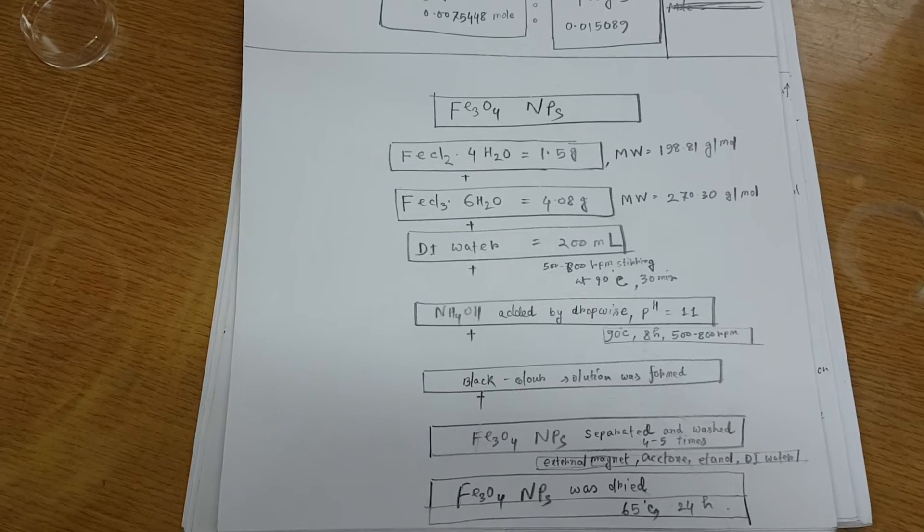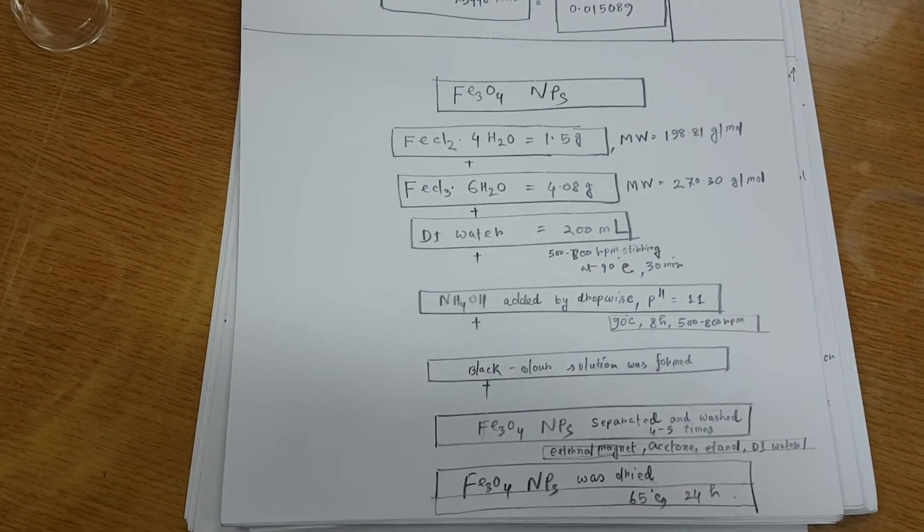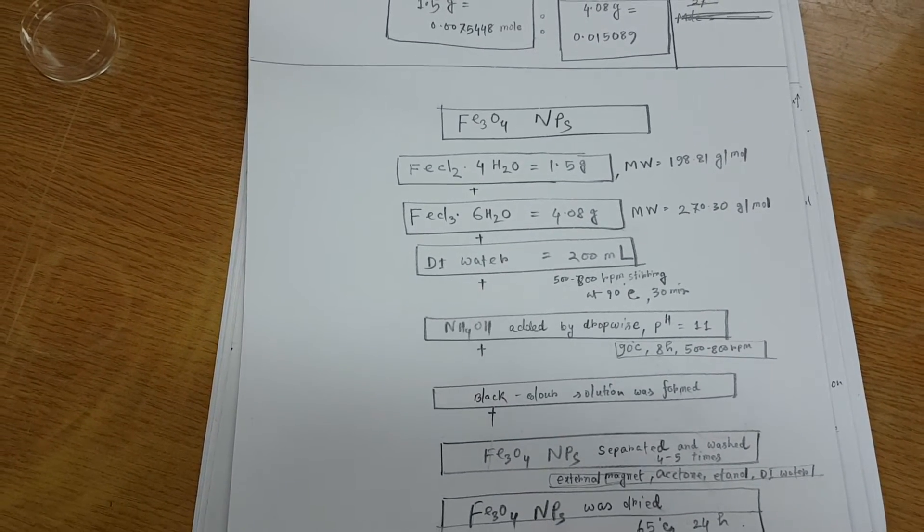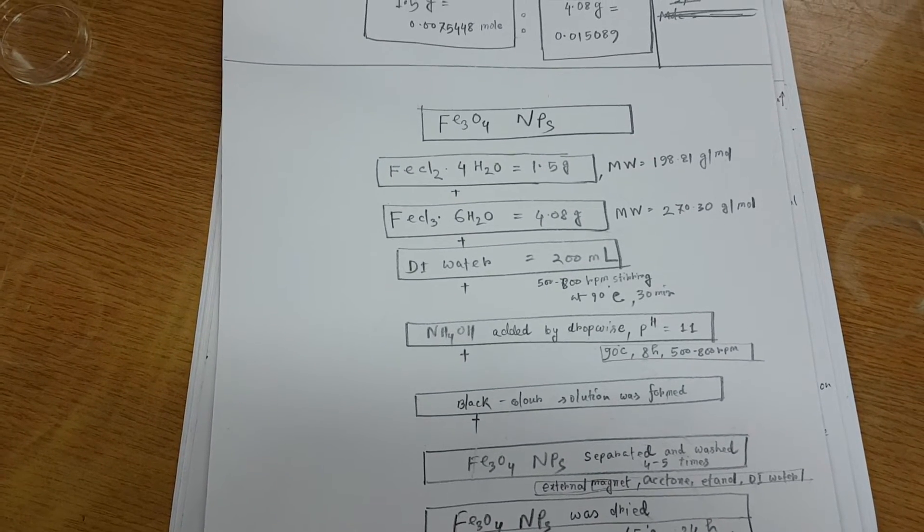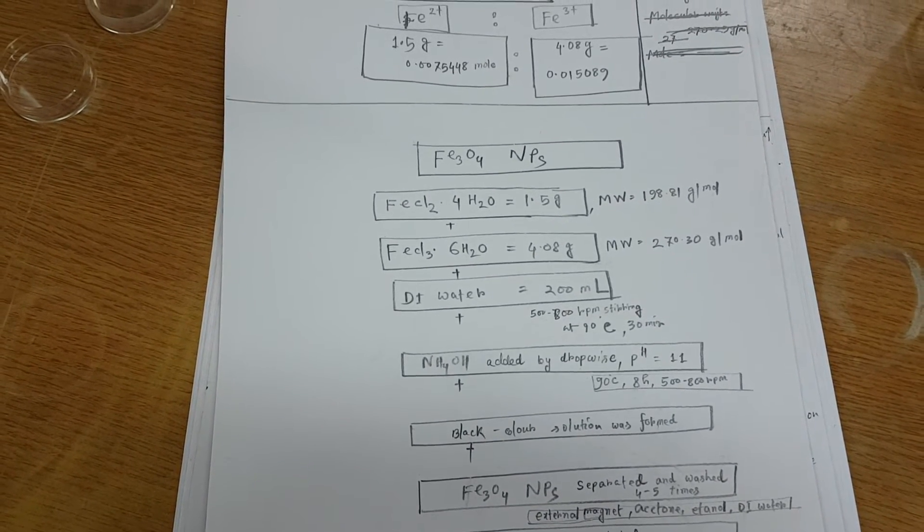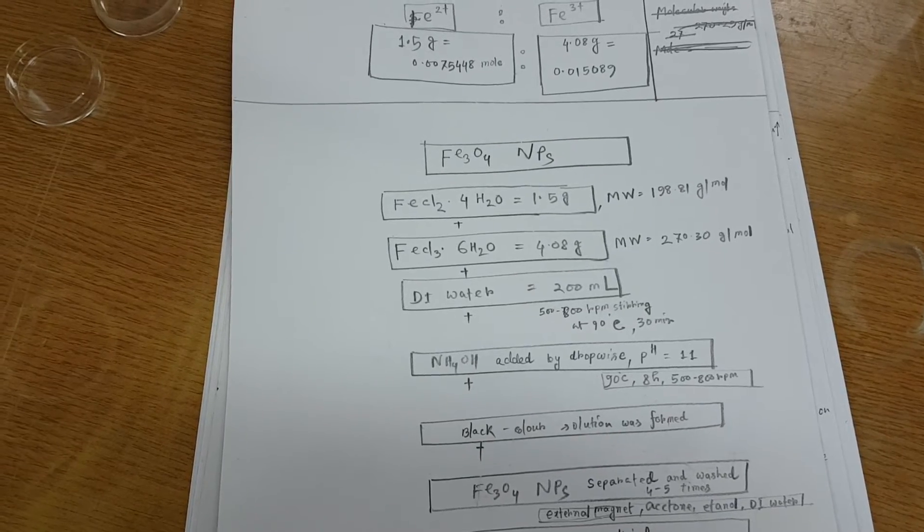And then I add 200 ml DI water for the homogenous mixture. Temperature, I set by 90 degrees Celsius for 30 minutes.